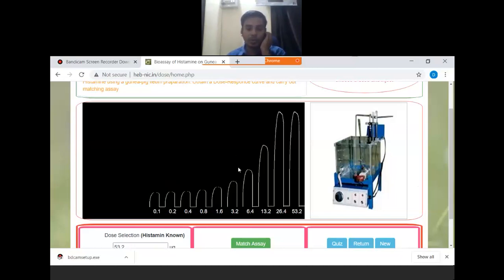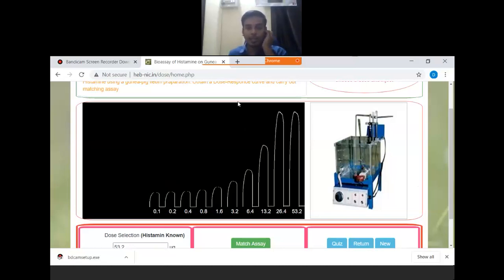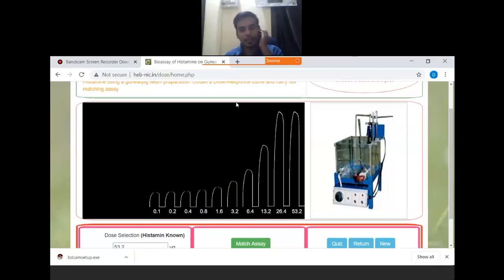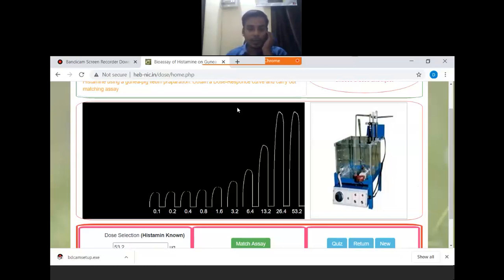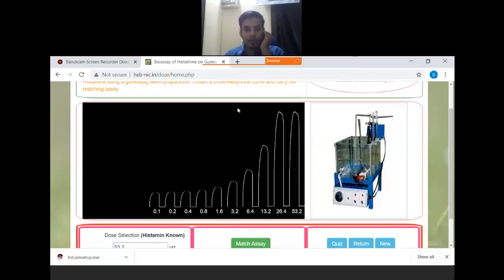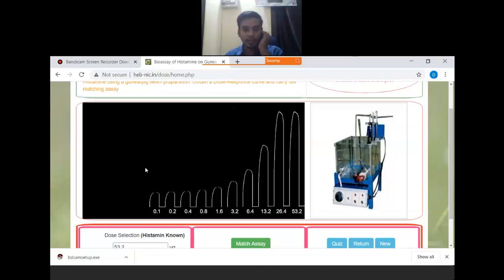After this, if we increase with another addition of the drug, the response cannot be increased, it will remain the same. So for this experiment, the response height as well as their individual presentation have to be considered.